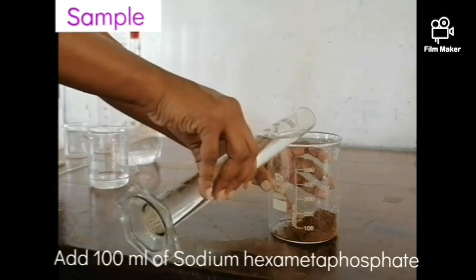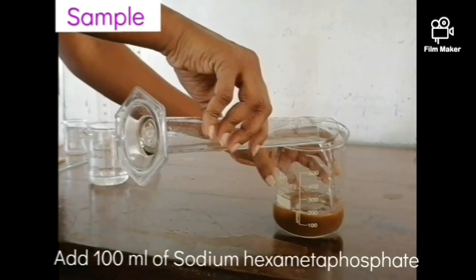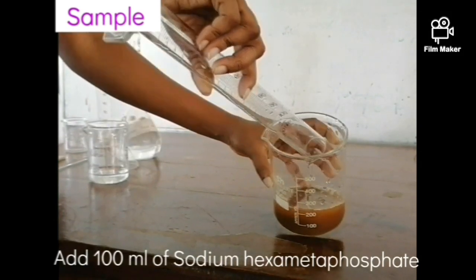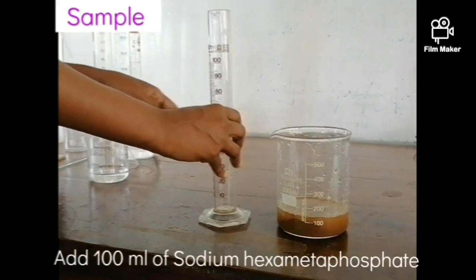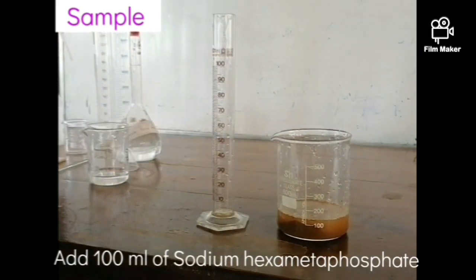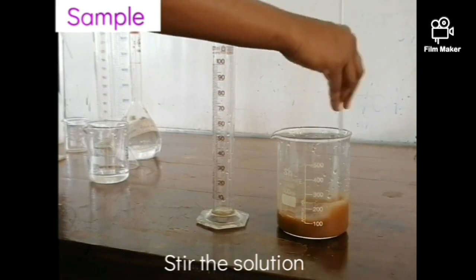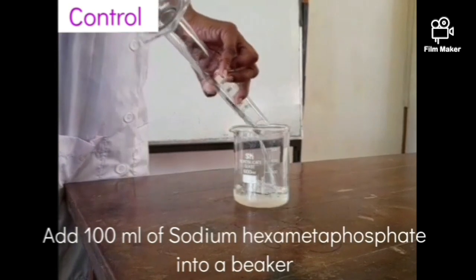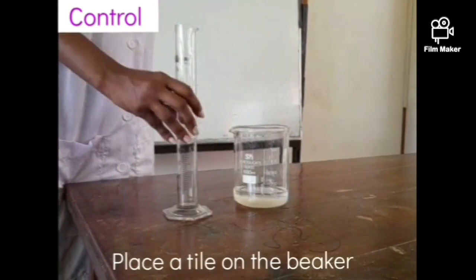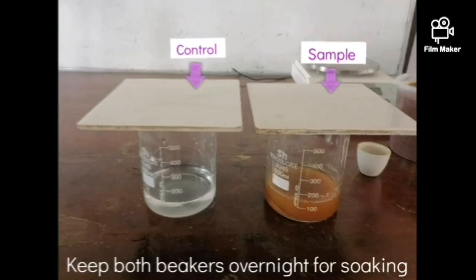Next, add 100 milliliters of sodium hexametaphosphate as dispersing agent and mix the content thoroughly. Also add another 100 milliliters of sodium hexametaphosphate separately into a separate beaker and leave them both to stand overnight for soaking.